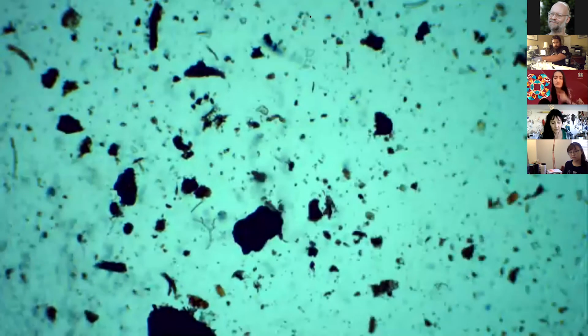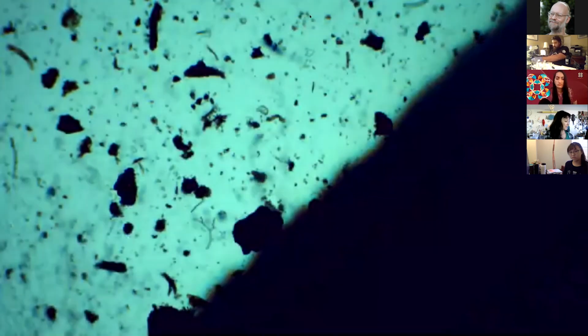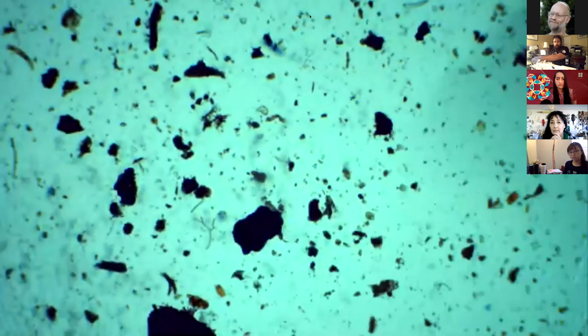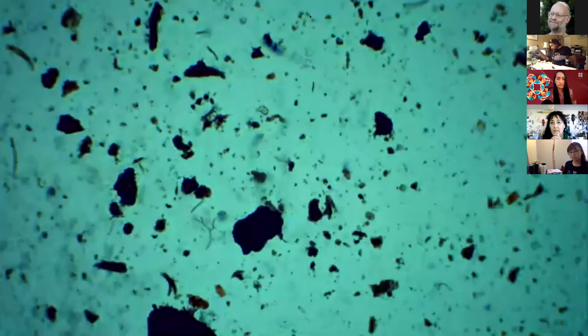All right, so now I'm gonna try to get some general focus going on. I want to lower the intensity of light. All right, so in the event we don't find anything too interesting, I've got some prepared photos I did the other day, but let's take a little detail in here. I'm gonna just make sure that my objective is focused right. All right, 2 yellow, 2 blue, just right. All right. So that way my focus.